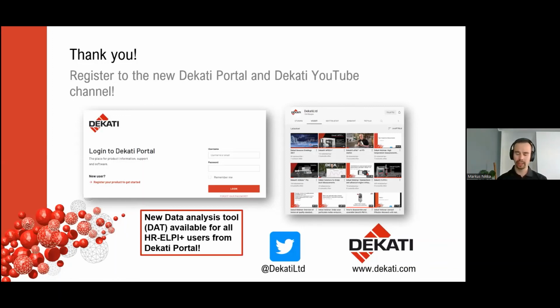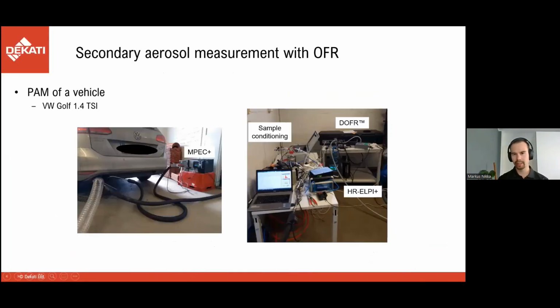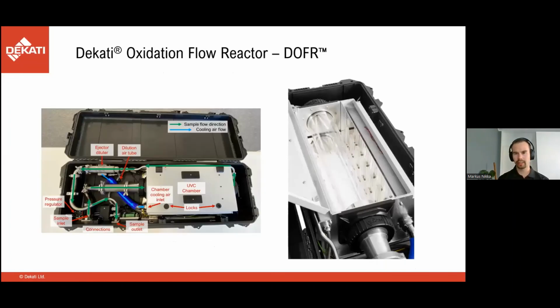And to minimize the effect, the box works kind of like a mirror, so it balances the effect.